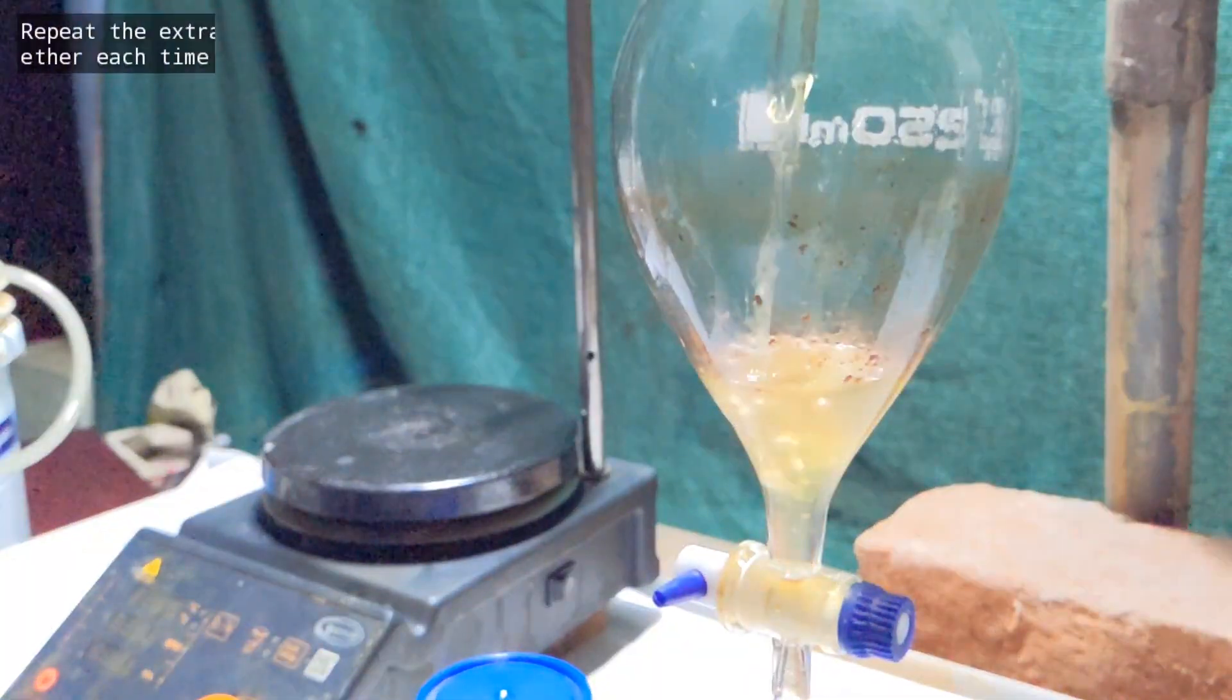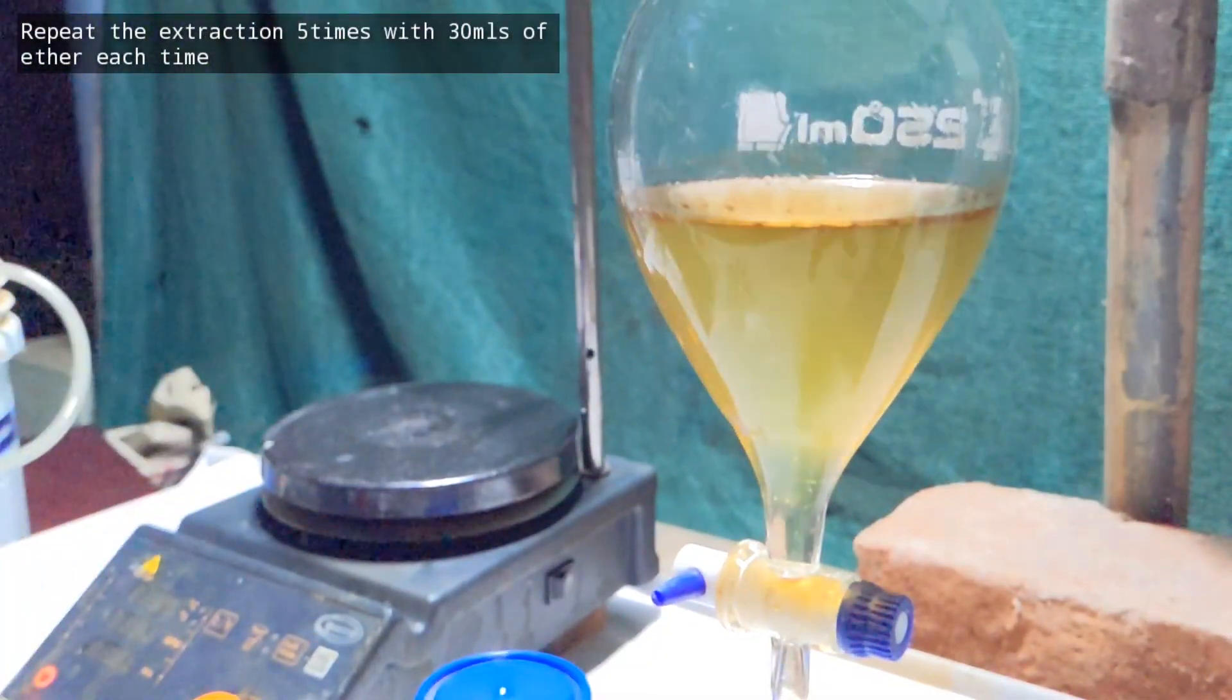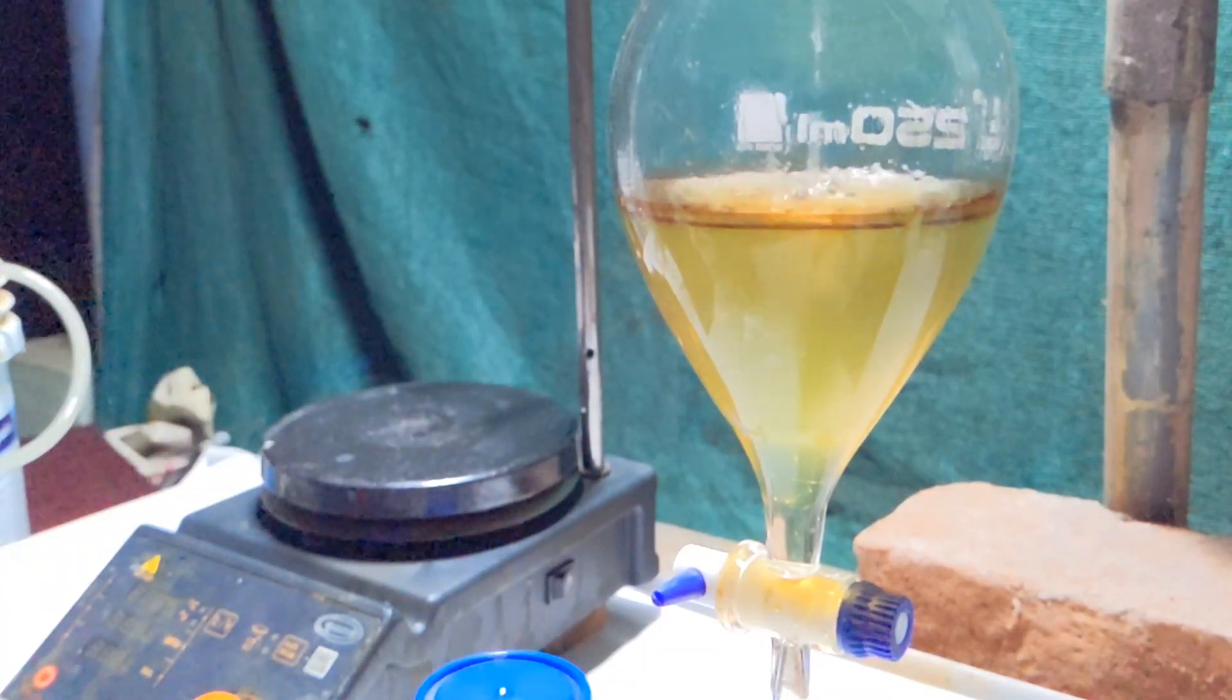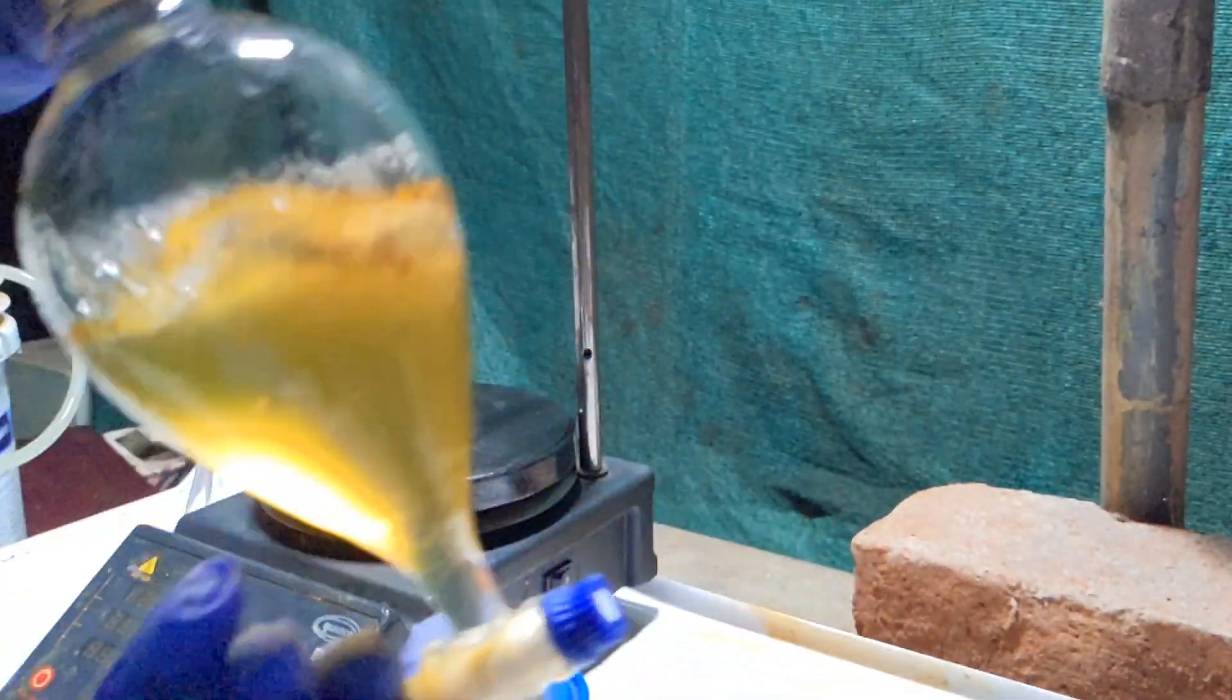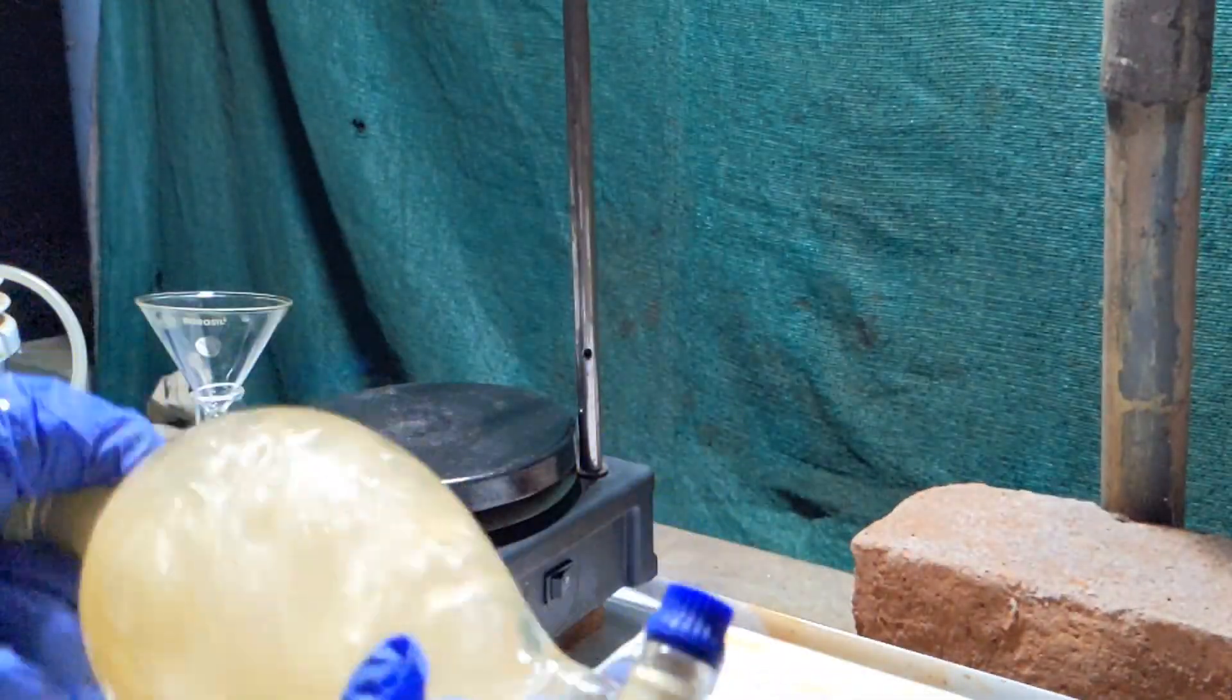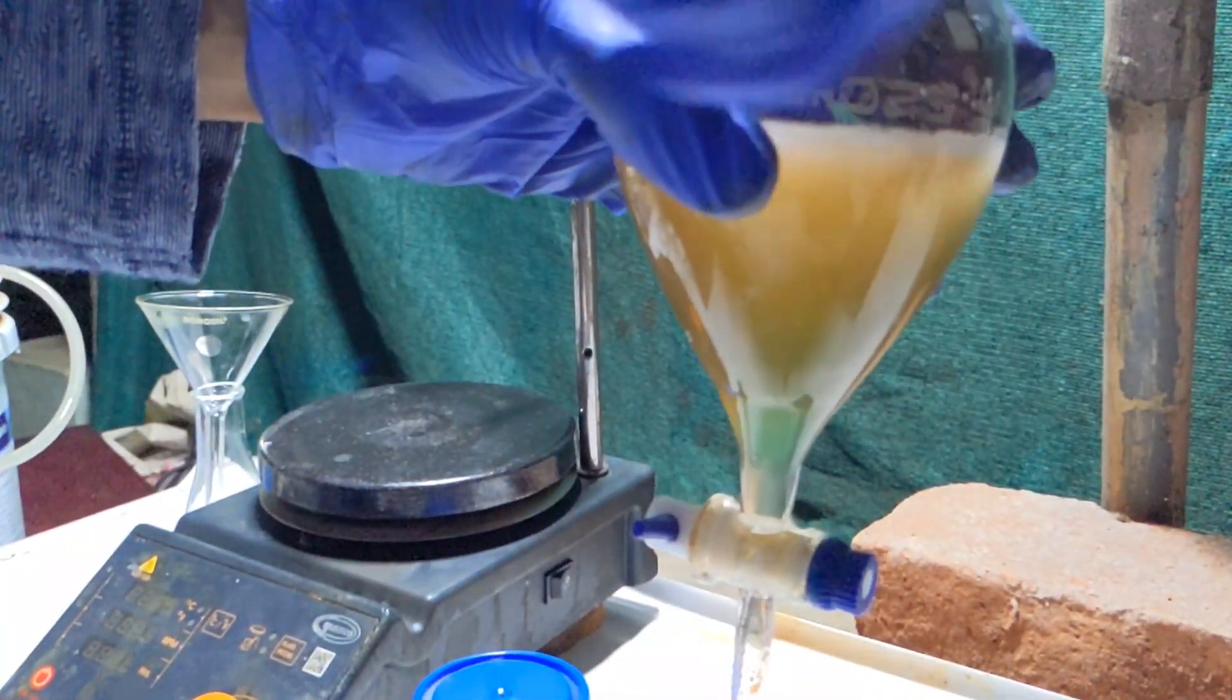After the first extraction, transfer the aqueous layer back into the separatory funnel and add another 30 ml of diethyl ether. Repeat this procedure 5 times with diethyl ether 30 ml each time, and this will make sure that all of the benzyl alcohol is extracted from the solution.